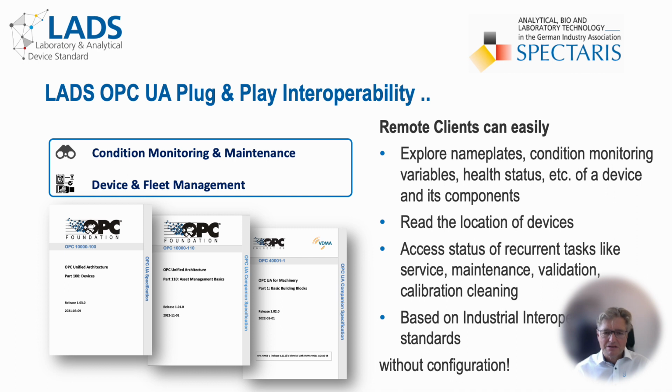The building blocks for use cases related to asset management and service leverage existing and well-established OPC UA companion specifications, including devices, asset management basics, and machinery basics. This approach ensures that laboratory and analytical equipment can be cross-industry compatible for those specific use cases. I think this is a very valuable feature to have.